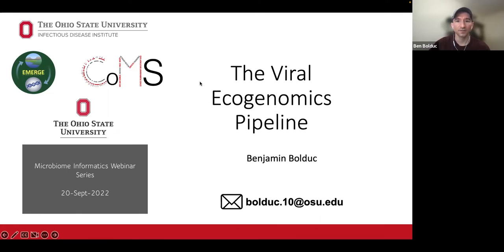So this week, we're going to go through the viral ecogenomics pipeline on both Cyverse and KBase. I will try to go through Cyverse a little faster because it will be easier to show you very specific details about each section in KBase than it is in, what's it called, than in Cyverse.